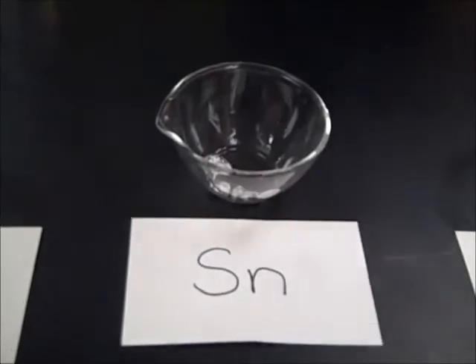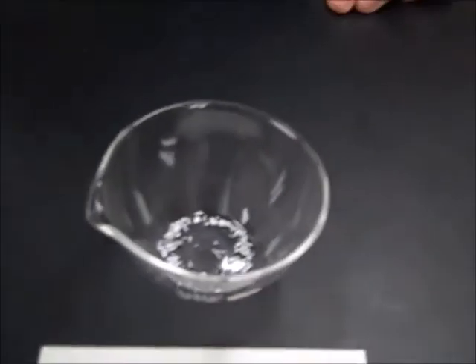It's as exciting as tin gets. All right, and the last one is going to be calcium.